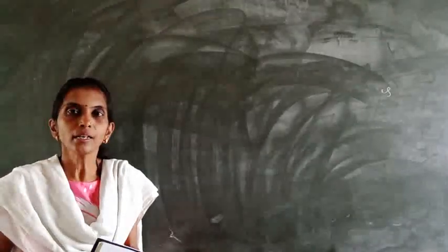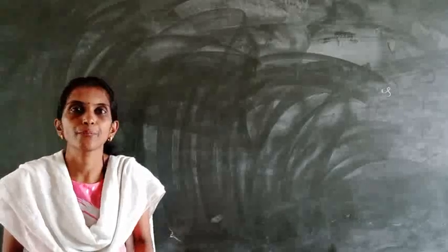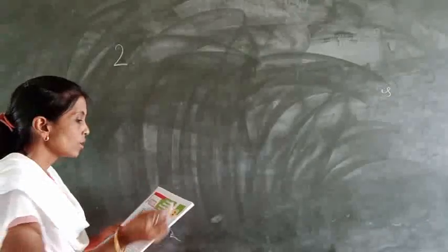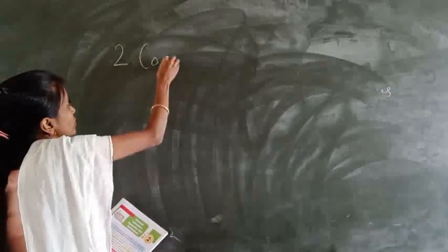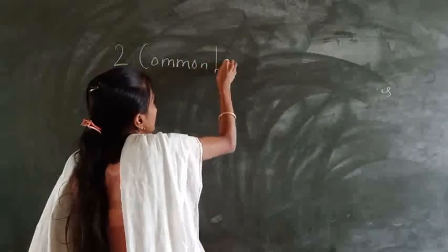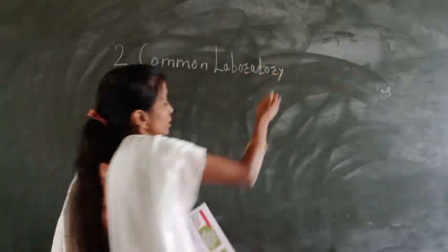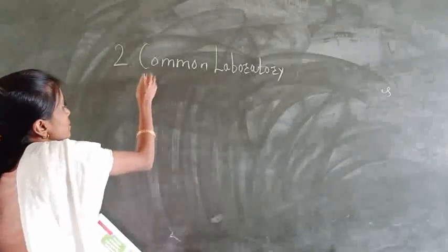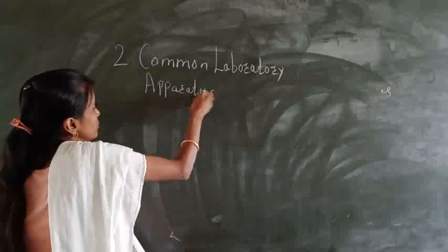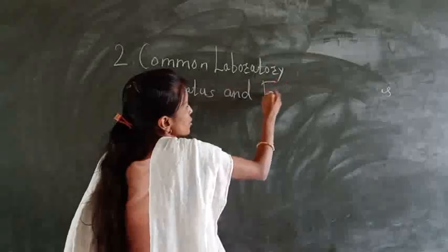Today we again start the next chapter of chemistry, the second chapter: Common laboratory apparatus and equipment.